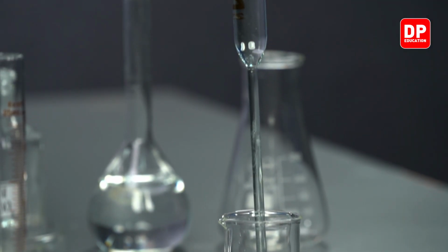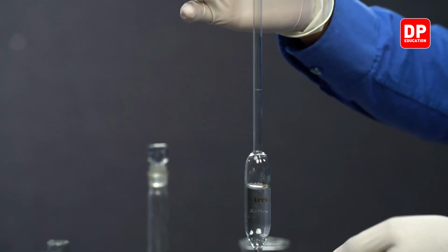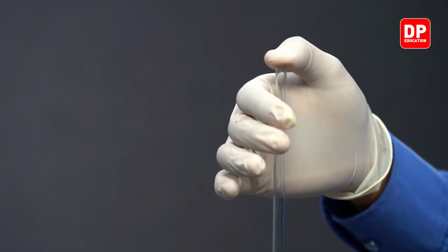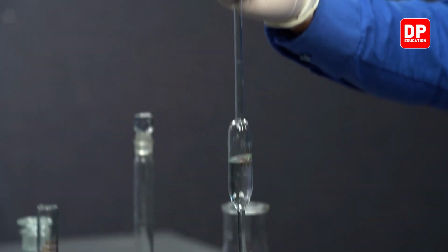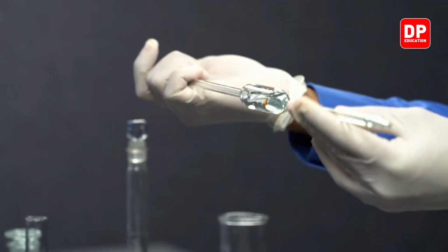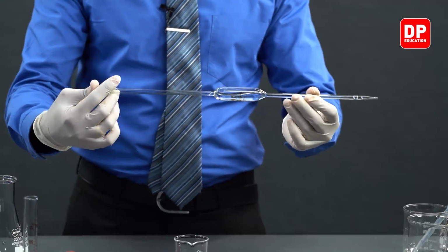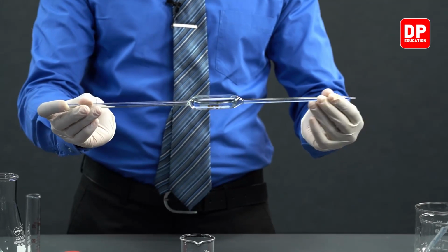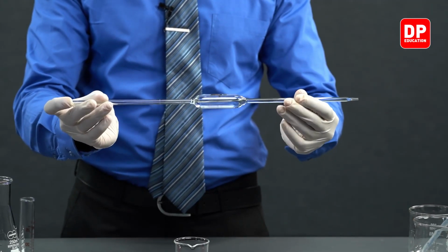After taking an adequate amount of the potassium oxalate solution into the pipette, as you can see, I'm keeping my thumb over here to make sure the entire solution doesn't fall back into the beaker. You can take the pipette out and keep it horizontally like this and turn it around, making sure all of the interior walls of the pipette are completely coated with potassium oxalate.